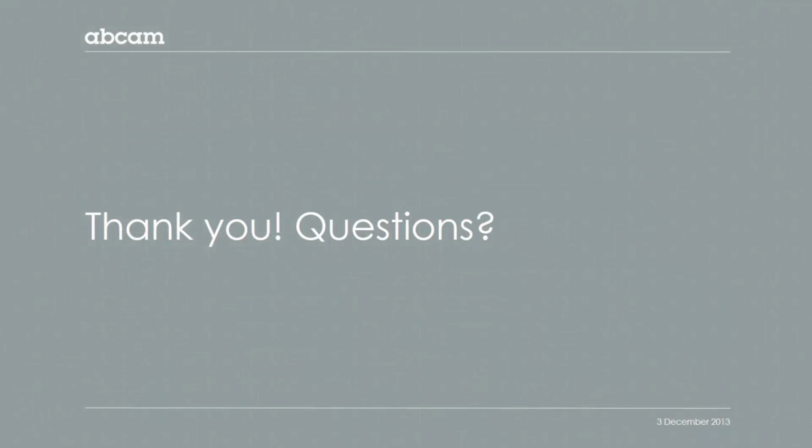Thank you, Augustine. So I've had a look at a few of the questions that have come in while the presentation has been given, and I'd like to go through a few of those with you now. So Petra has contacted us and asked if there are any differences between PBS or TBS for doing ICC-IF and how to choose between one or the other.